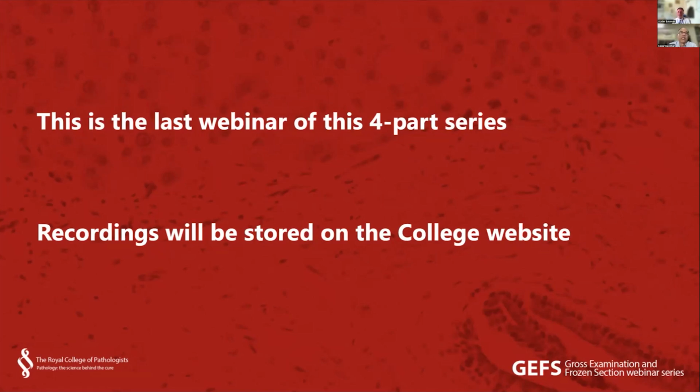Okay, yeah. There's one very practical question. Do you use any ancillary stains to differentiate between pT2 and pT3 tumors in difficult cases? Not usually, no. I suppose you could use the desmin stain to highlight the muscularis propria. I tend not to.